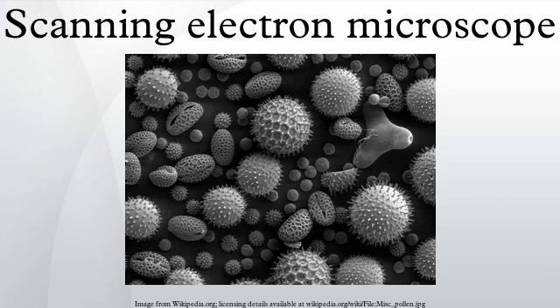Gallery of SEM images. The following are examples of images taken using an SEM. See also: forensic engineering, forensic science, list of surface analysis methods, energy dispersive X-ray spectroscopy, transmission electron microscopy, Teeny Ted from Turnip Town. Microscopy. References.